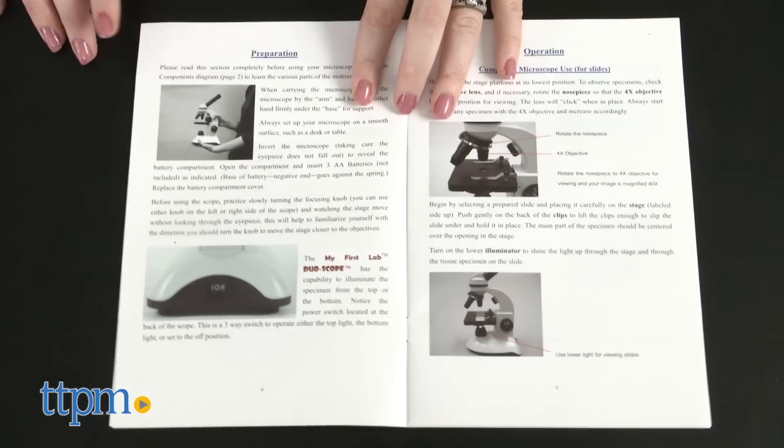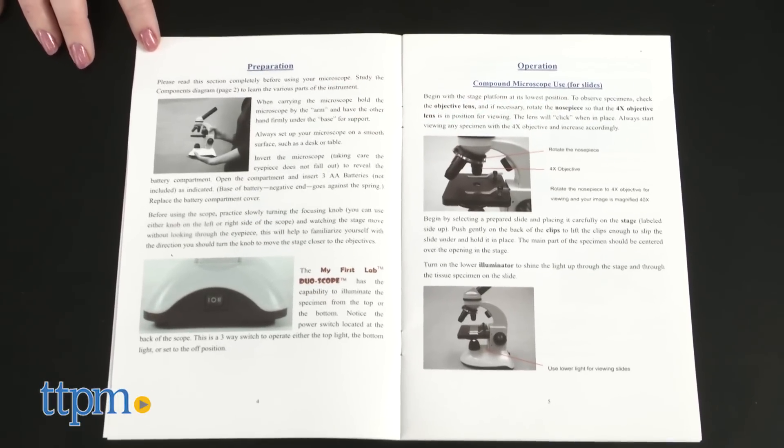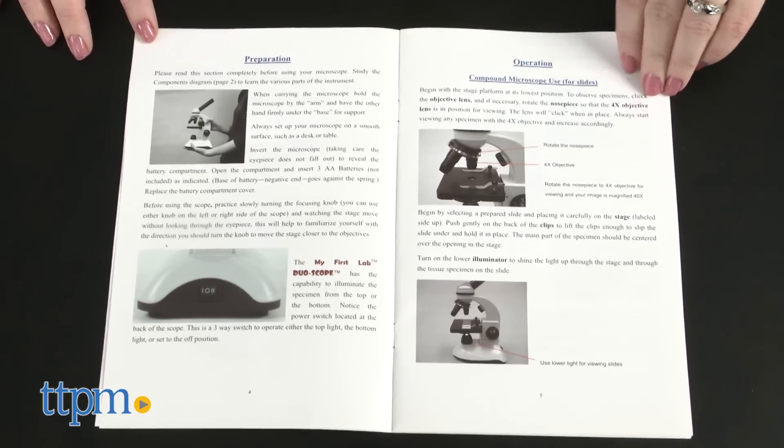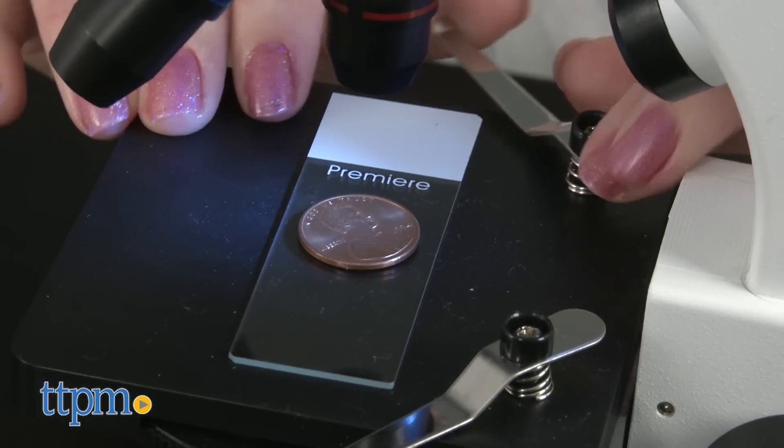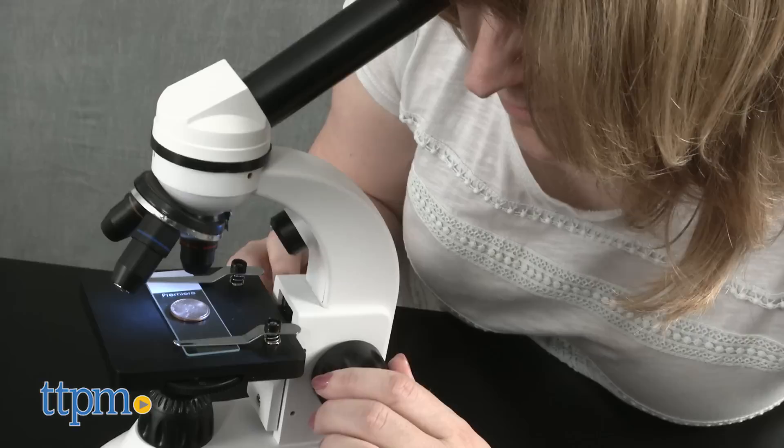The instruction manual guides kids in the preparation and operation of the microscope and then offers ideas for things that they can observe, such as salt or a penny. You'll need three AA batteries, which are not included.